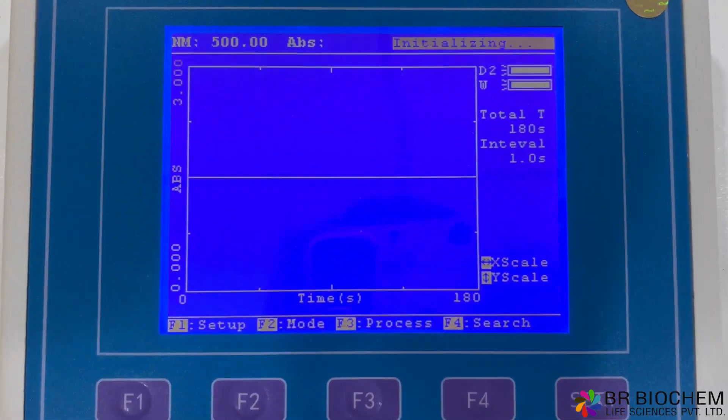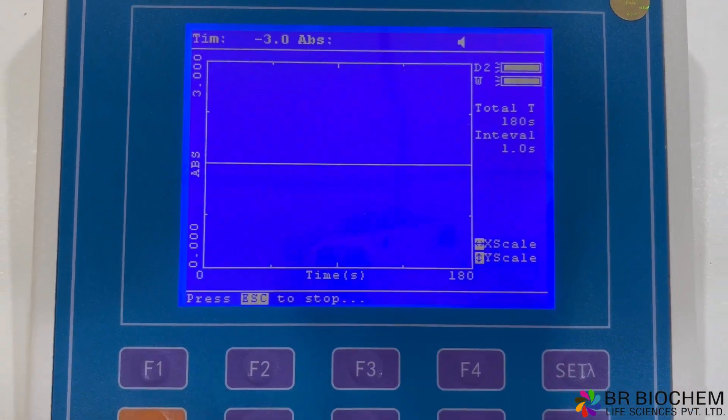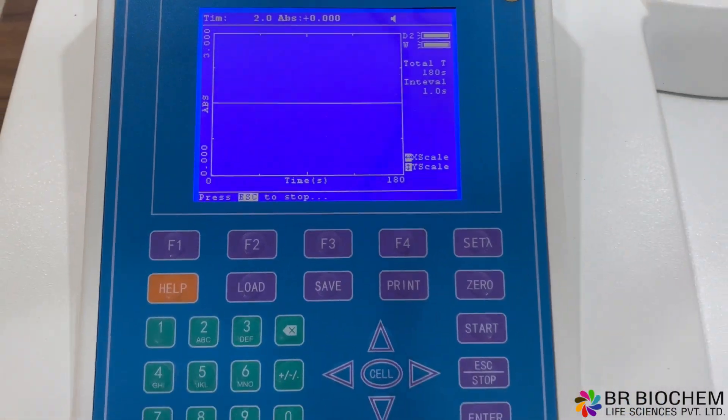Moreover, the spectrophotometer supports DNA/protein testing, allowing quick and accurate concentration calculations based on absorbance ratios.